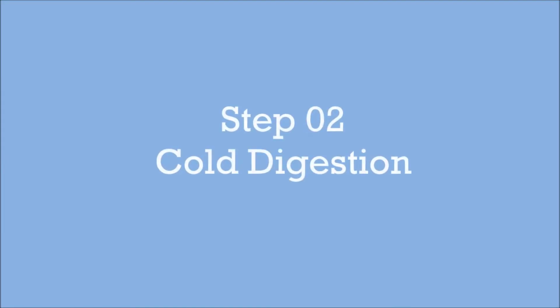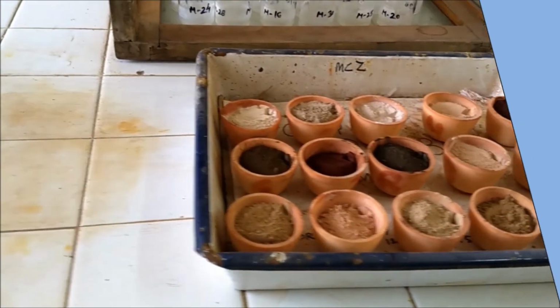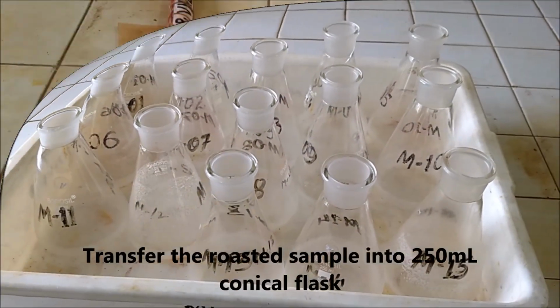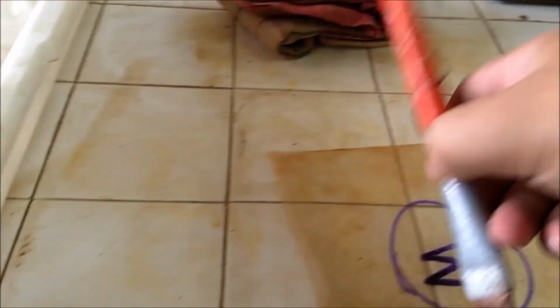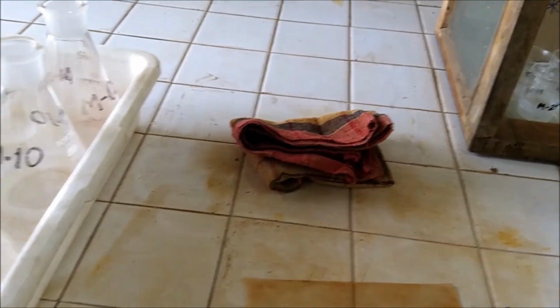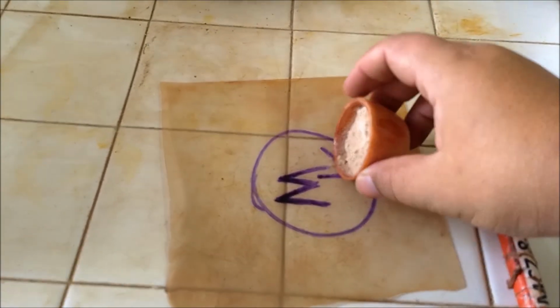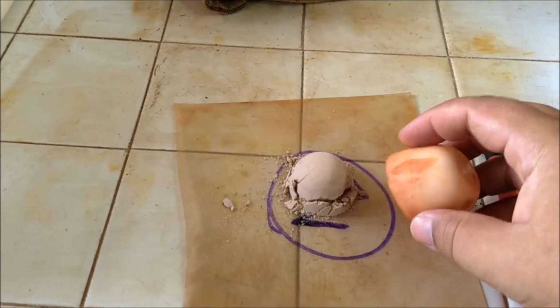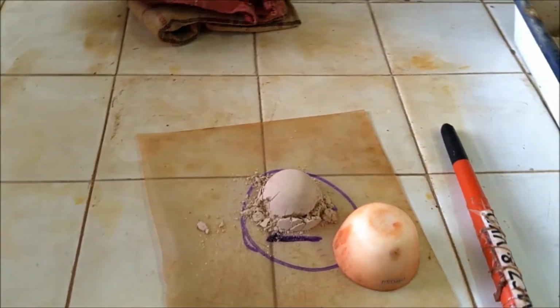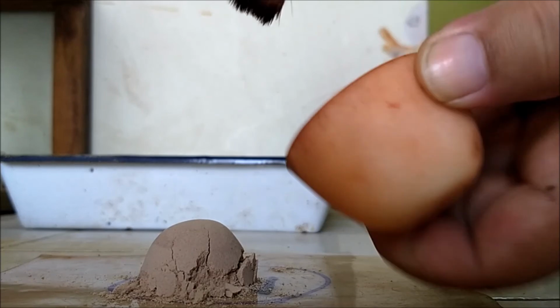Now this is the second step called digestion, and these are the finely roasted samples, and these are the very clean conical flasks. With the help of a brush and plastic sheet we will transfer from the crucible to our conical flask. This is the way to transfer these samples, and you can see this stuck matter will be cleaned with the help of a brush.